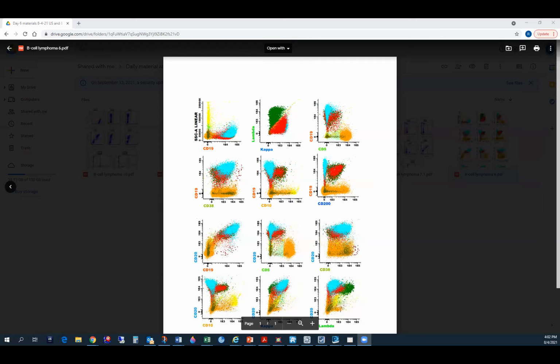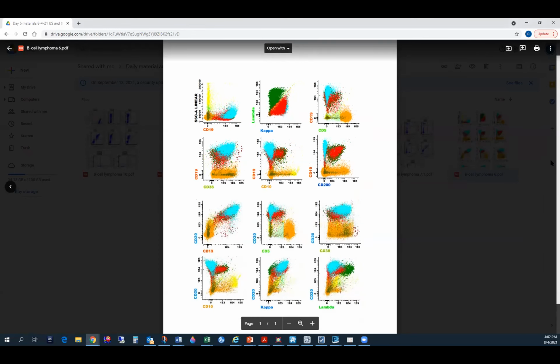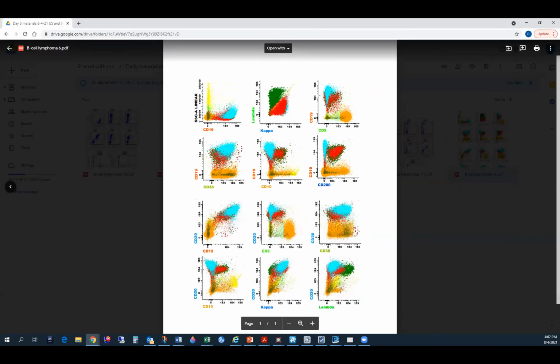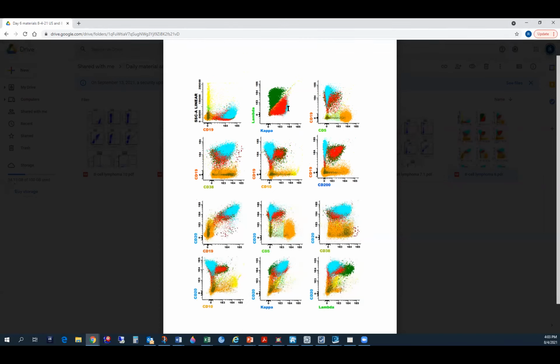Okay, I'll tell it when we come to that. So for me, the population of concern in this one was the aqua colored population. In the next kappa to lambda graph, I think these are the normal kappa to lambda ratio cells, and then in the next, the aqua is hiding behind the red one to me. Correct. Yes.